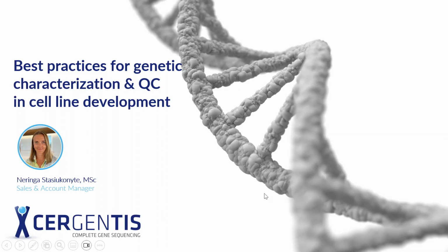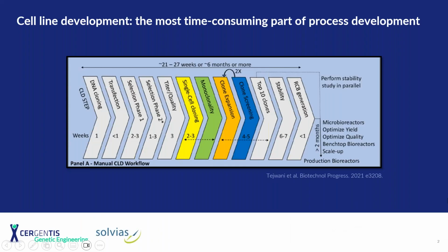So let's move to the first slide. Yes, perfect. As you're probably well aware, CLD is often regarded as the bottleneck within the pharmaceutical supply chain, as shown on this image. In fact, the entire process usually takes several months. And current CLD best practices still rely on a series of laborious, resource-intense, and time-consuming processes.